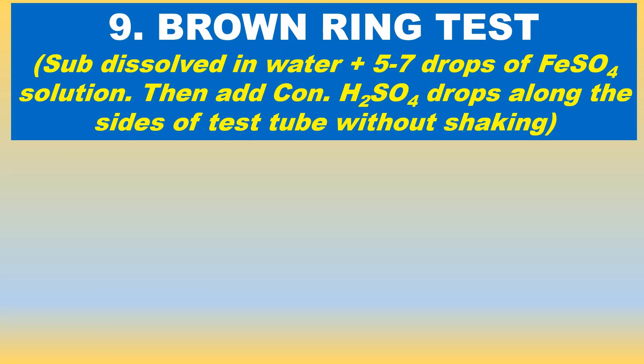Let us now first see the brown ring test. It is for nitrate salt. Take the substance in a test tube and dissolve in water. Nitrate salts are soluble in water. Add 5 to 7 drops of ferrous sulfate solution to it.